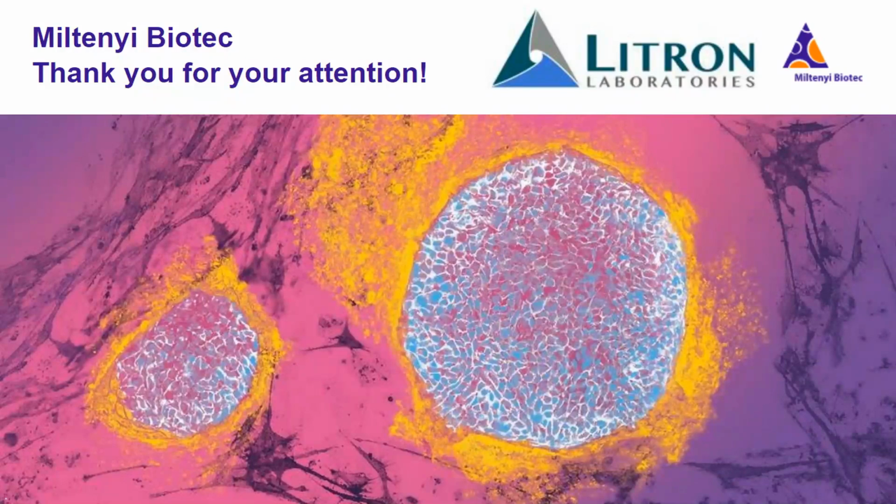Wonderful. And it looks like we have time for one more question. Can the MACSQuant be used for a validated assay? Yeah, this is sort of a broad question, I would say, but it's an important designation to make that you can use these in a regulated setting.